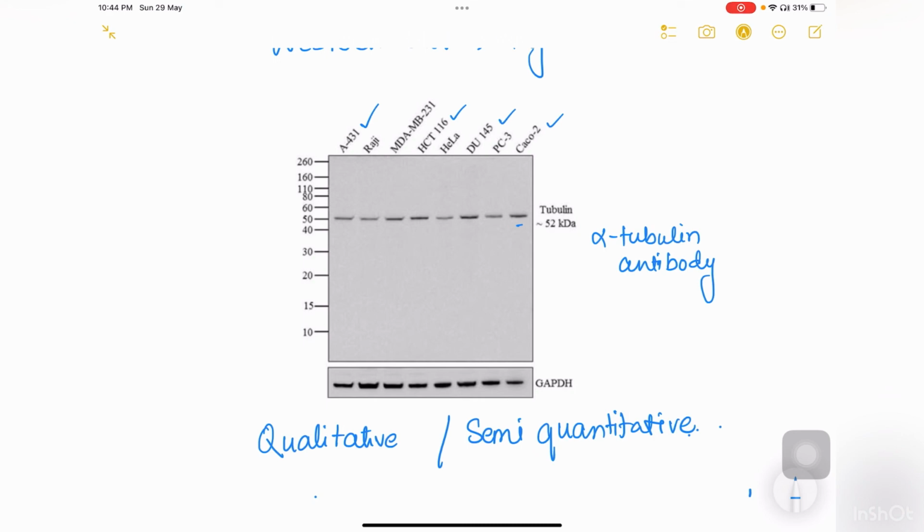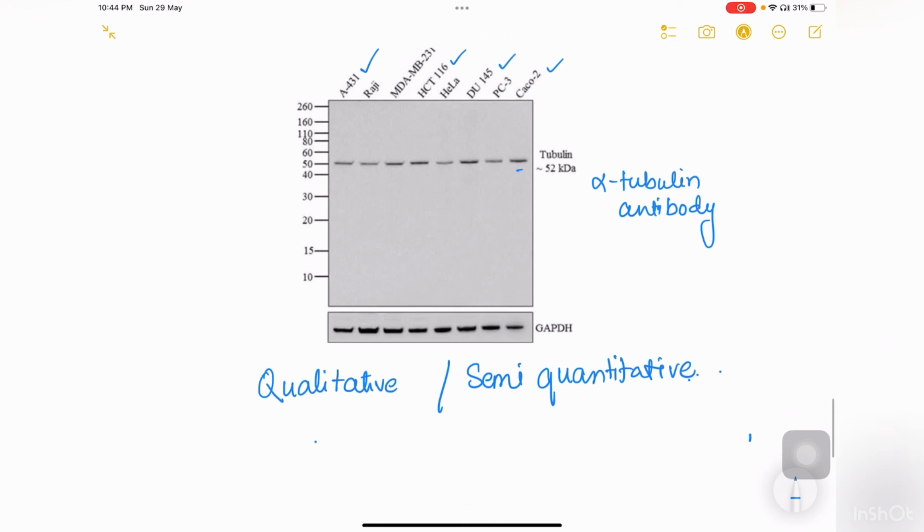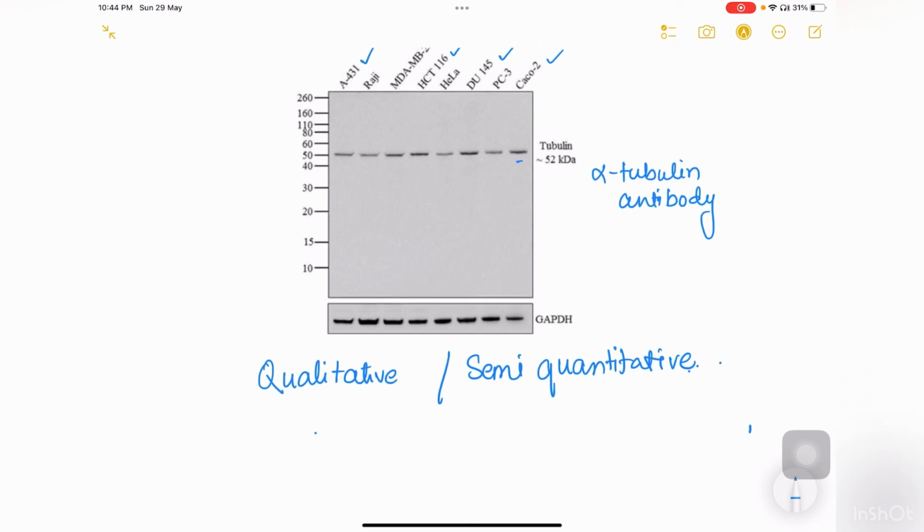Western blot can give us qualitative information or also semi-quantitative information about the expression of different types of proteins. Qualitative means whether the protein is present in the cell or not, and semi-quantitative means we can get an idea about the relative abundance of the proteins, whether the protein is expressed more or whether the protein is expressed less. So that's all about Western blot.